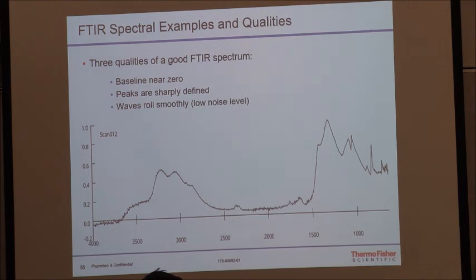With all three devices, if that happens to you and it's 2 o'clock in the morning, and you go out somewhere and think, you know what, I'm just not getting anything, and it's giving me good data, it's not giving me a hit, on the back of the devices is the 800 number. Call the 800 number and say, can you help with this? And we'll reach back, and we'll walk you through that.